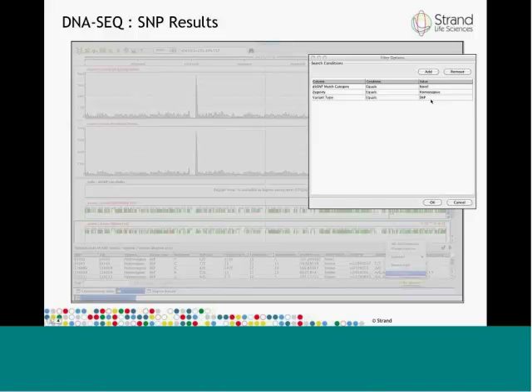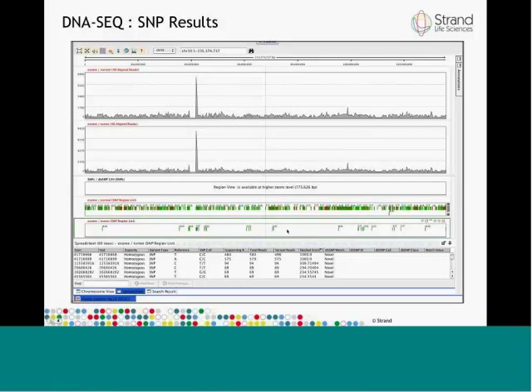I'm interested in SNPs. When you perform this filter, you'll see that this track that was a large clutter of SNPs across the entire genome is filtered to the narrow list of SNPs that I am interested in. You can again zoom into individual SNPs and inspect them carefully. You can double click the spreadsheet view and inspect a particular SNP more carefully, and so on.